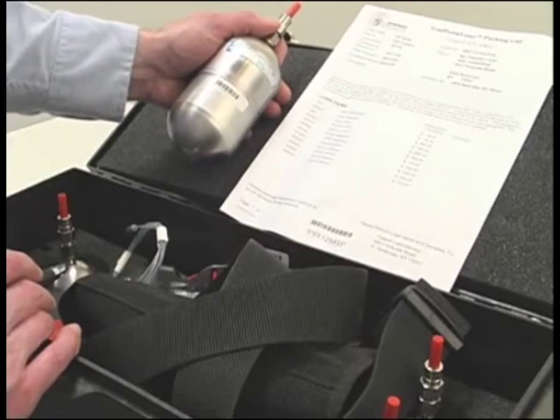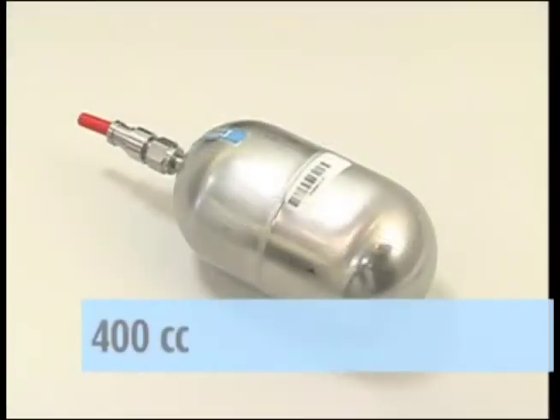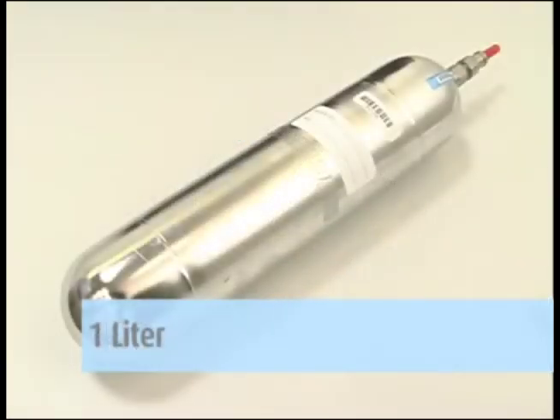If doing personal sampling, you will also receive tubing and belt holsters. The mini cans come in two different sizes, 400 cc and 1 liter.